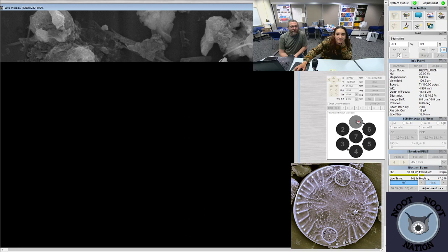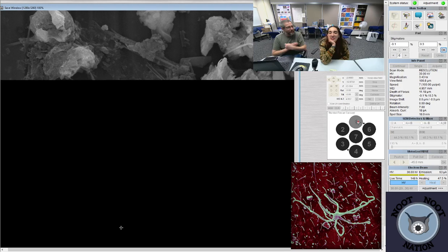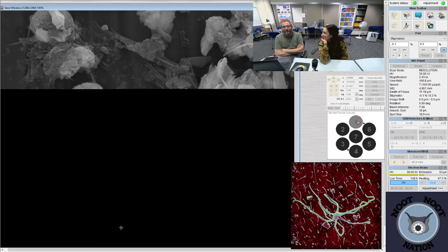Is this the epithemia? Yes. Okay. It's just somewhere here. It'll show up eventually. Yes. That's because you didn't turn it to be perfectly corner to corner. No, I didn't. You haven't been rotating the stage at all. No. I'm not judging. I'm just telling you.